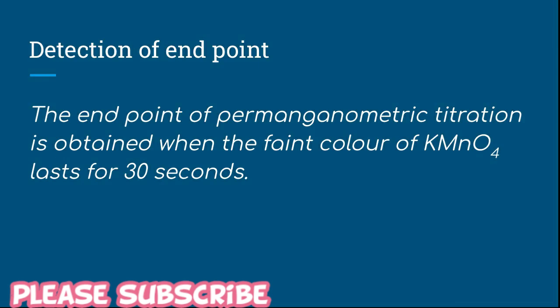Now how to detect the end point? When the pink color of permanganate persists for 30 seconds, then we confirm the end of the permanganometric titration. The end point lasts only 30 seconds because the excess MnO4 minus, which shows the pink color, reacts with Mn2 plus and forms MnO2. As a result, the color of MnO4 minus disappears after 30 seconds.